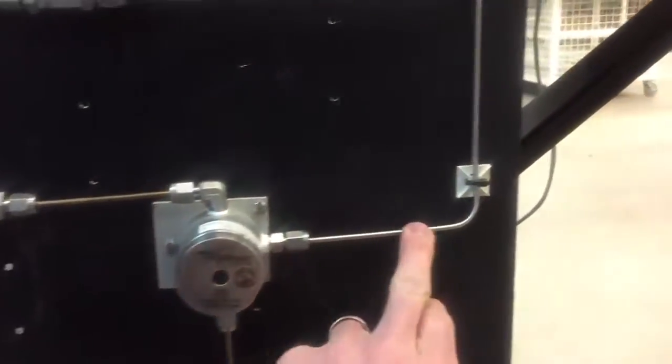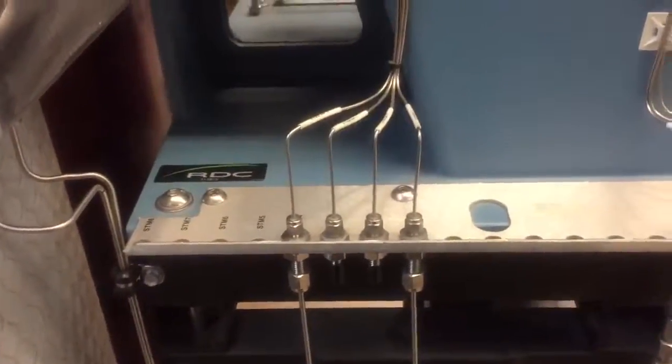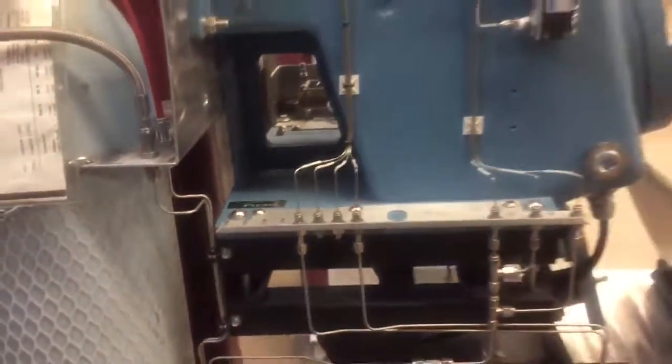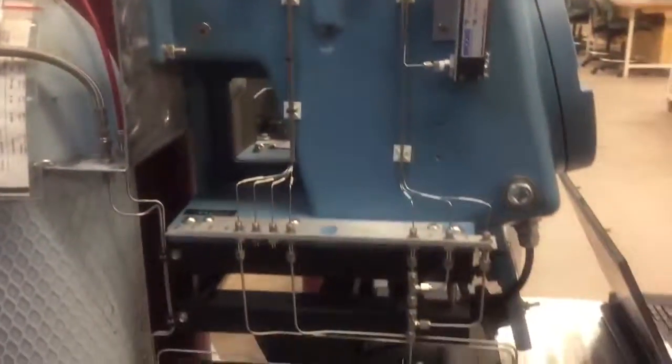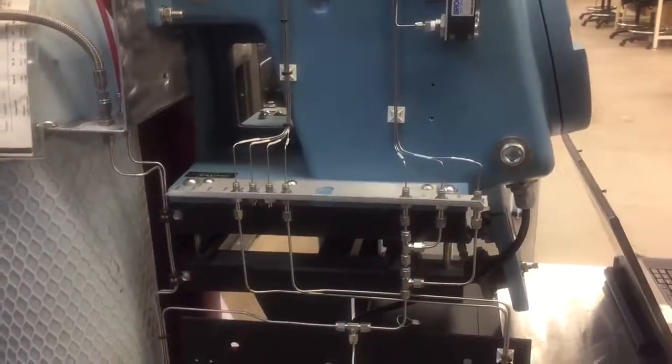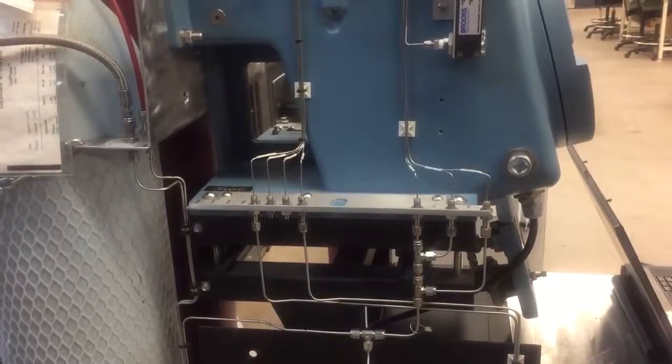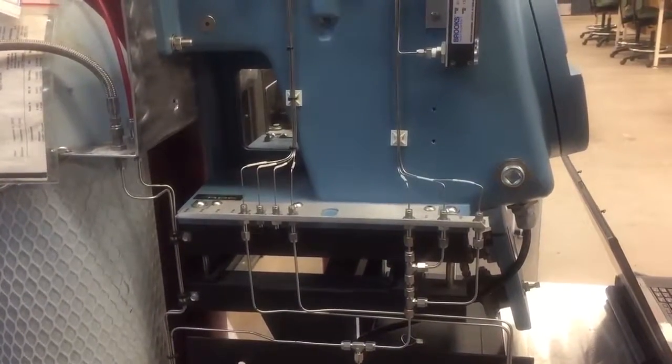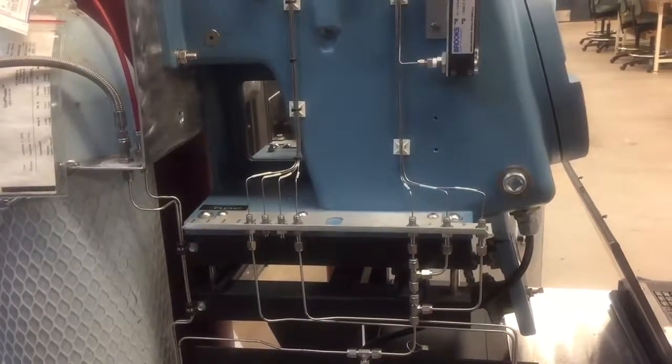You can see here the tubing, this eighth inch tubing flows up and over into stream one. So stream one internal analyzer is the live sample and stream four is the calibration. This analyzer has the ability, it has a bunch of valves and stuff inside here that will allow it to select and analyze either stream, the gas from the calibration stream on stream four or the natural gas from the college here on stream one.